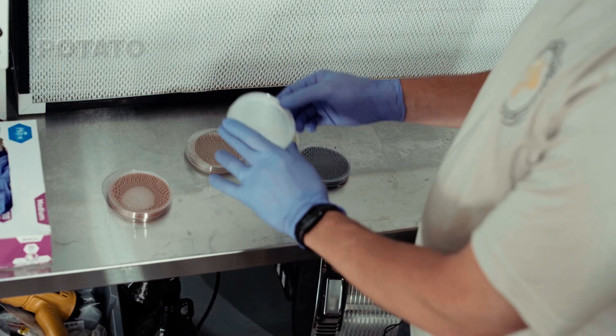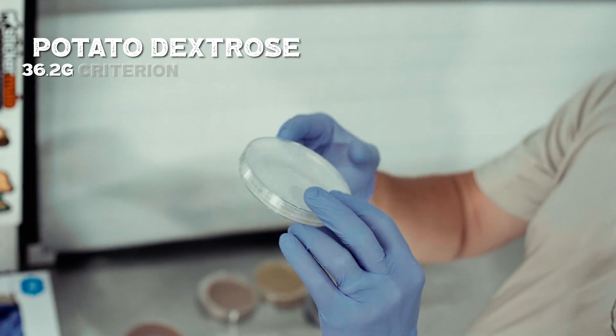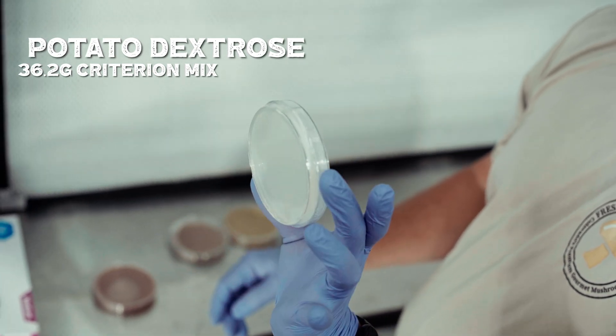Then I have potato dextrose agar. This is a lab grade agar — 36.2 grams of the Criterion pre-mix lab grade PDA.